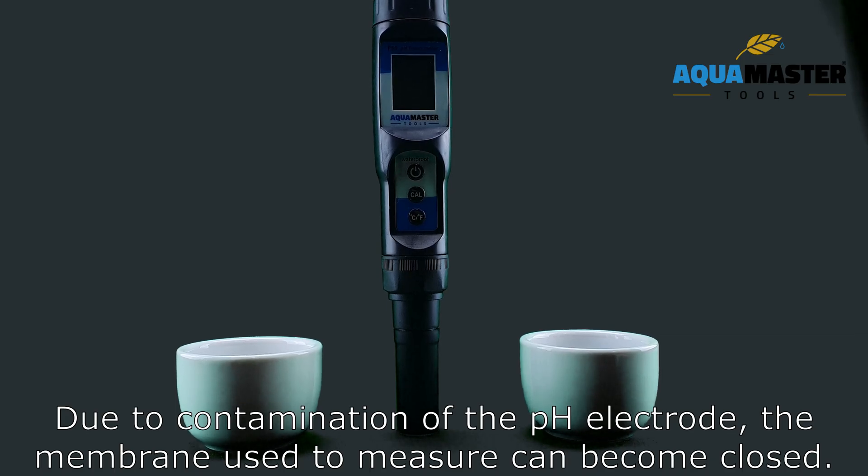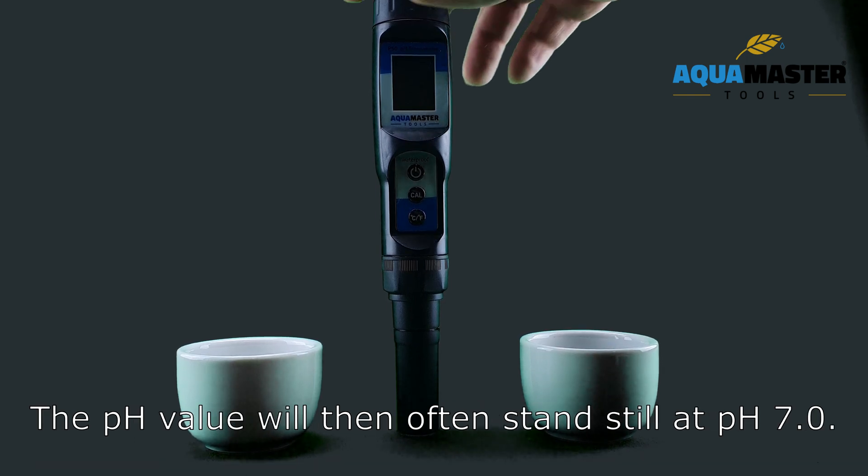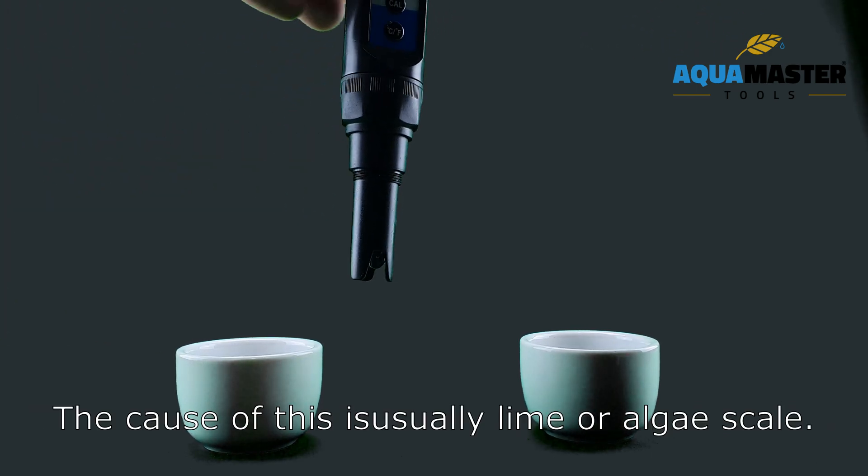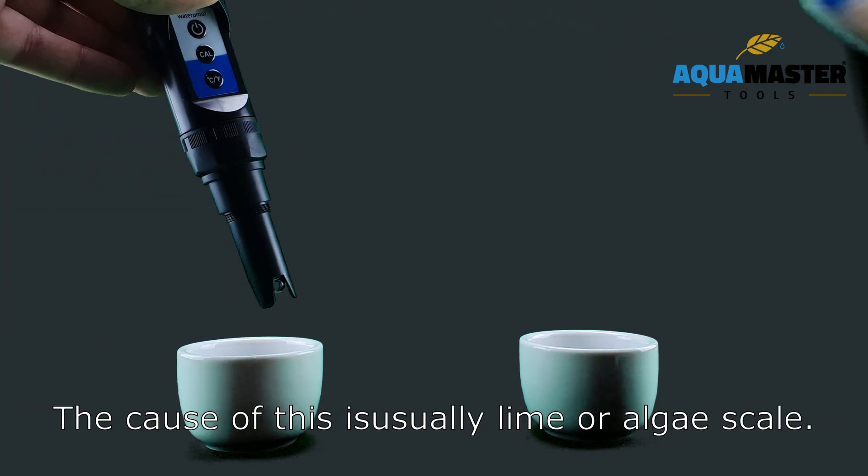Due to contamination of the pH electrode, the membrane used to measure can become closed. The pH value will then often stand still at pH 7.0. The cause of this is usually lime or algae scale.